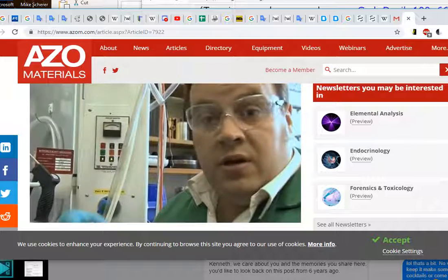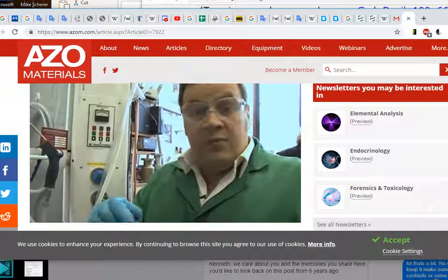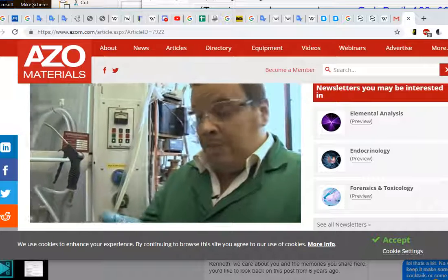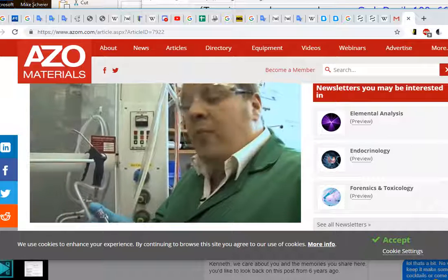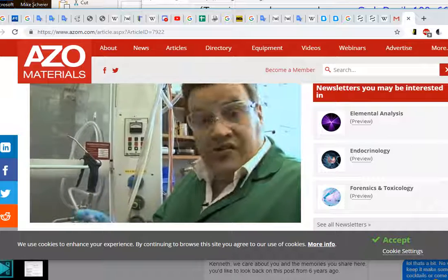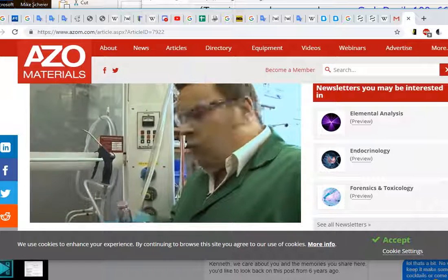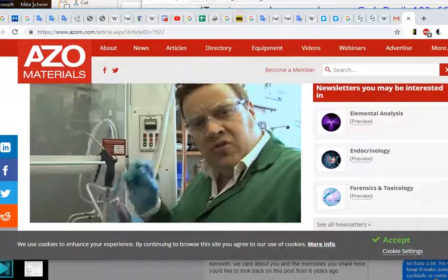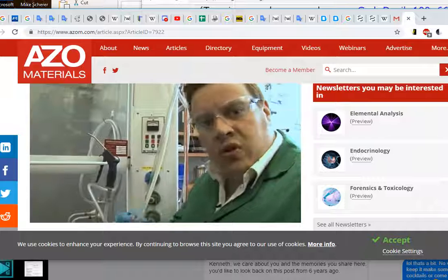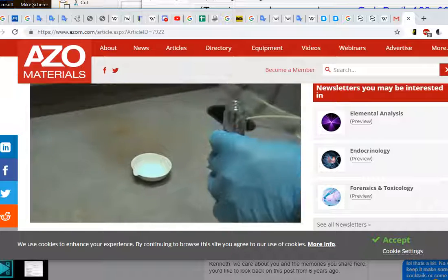So what we're going to do is mix it now with another element, and that element is aluminium. So aluminium has electrons to give away. Iodine's going to nab them. You're going to see some oxidation chemistry and the formation of a new compound, which is aluminium triiodide. It's a really nice chemical reaction, but the way that we do it is we mix the two together, and then we have to add water, which acts a bit like a solvent, but also the oxygen in the water activates the iodine so that it becomes more strongly oxidizing, and then hopefully we'll see the new reaction. So I'm just going to put some out into this small vessel.